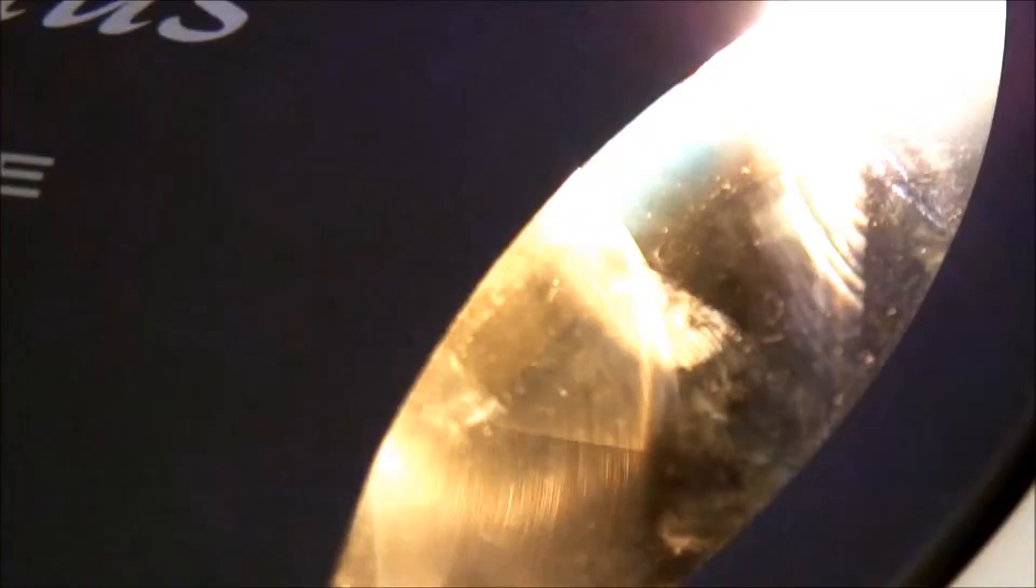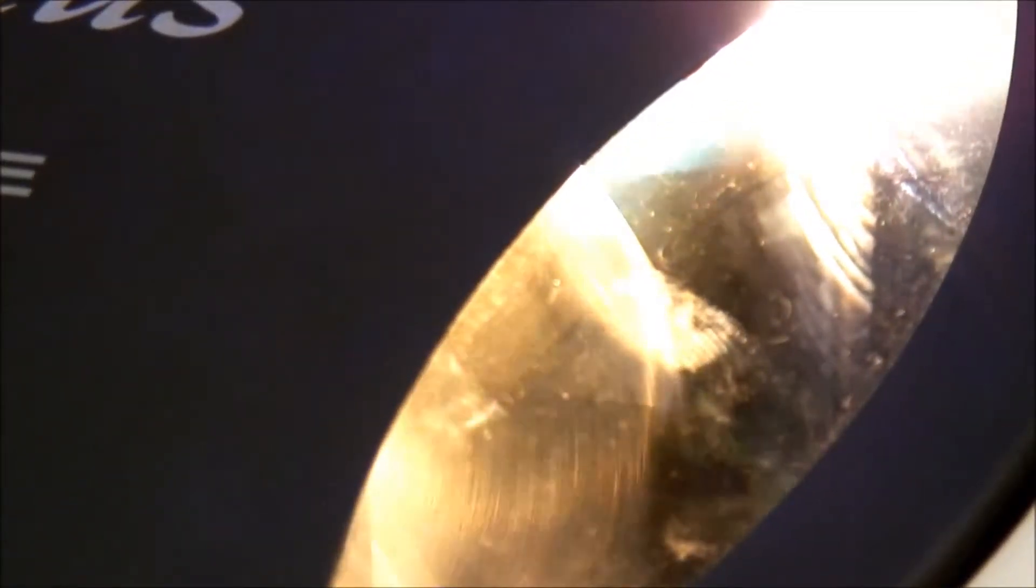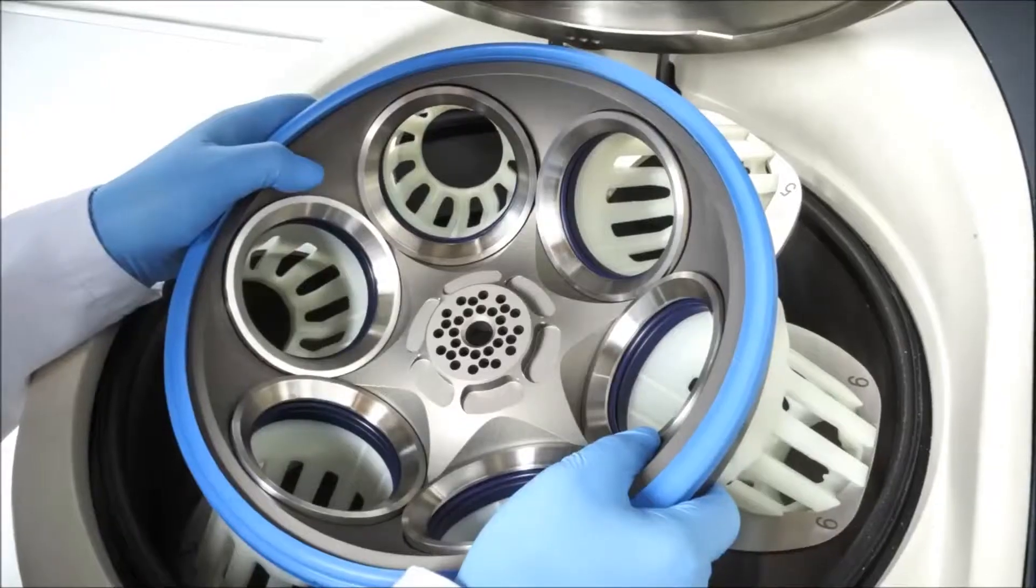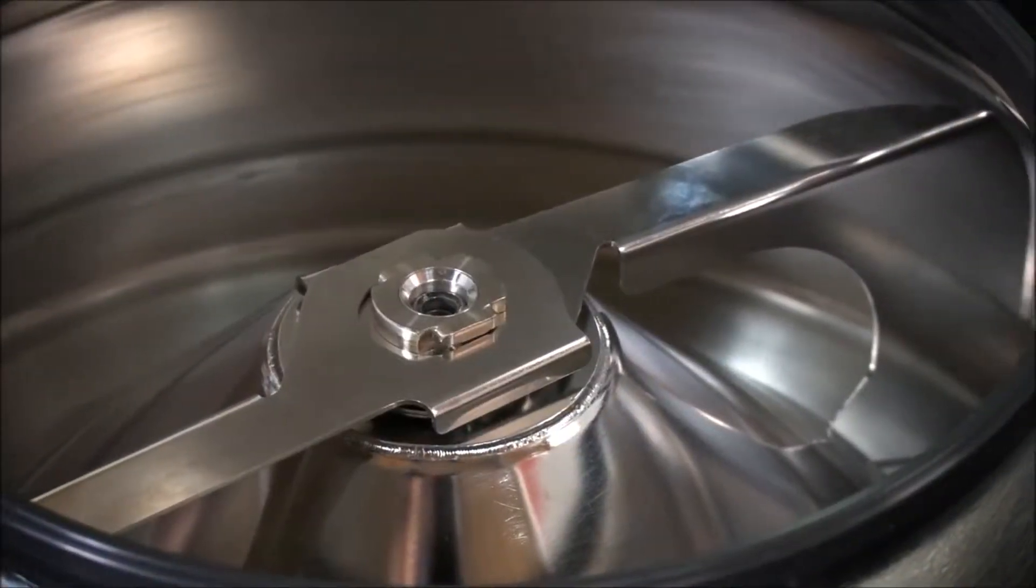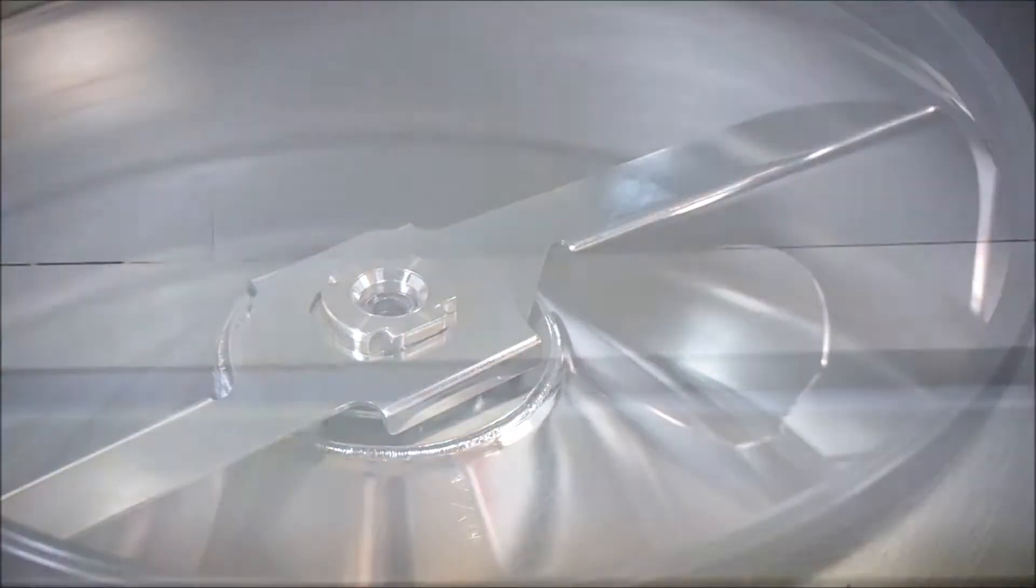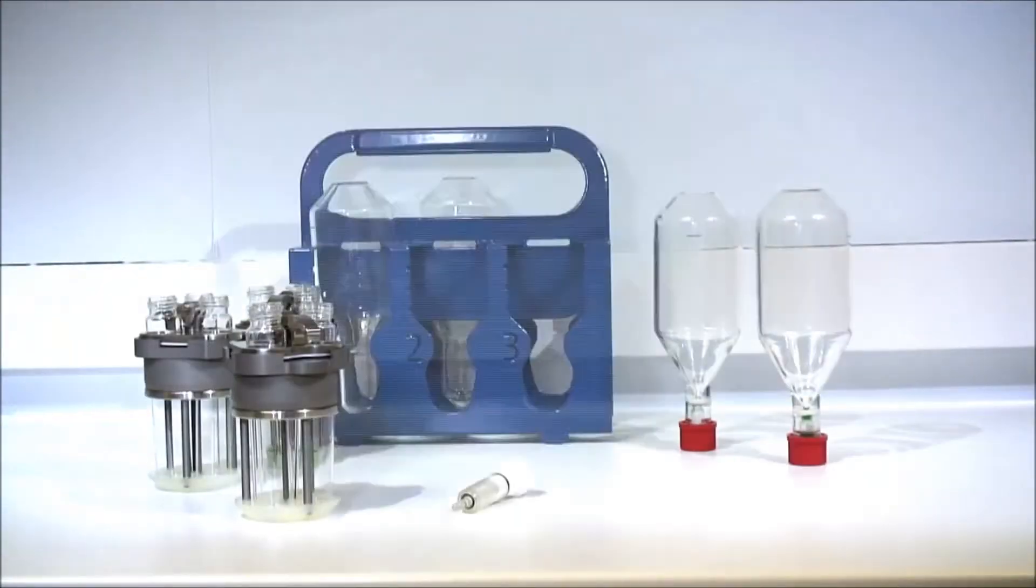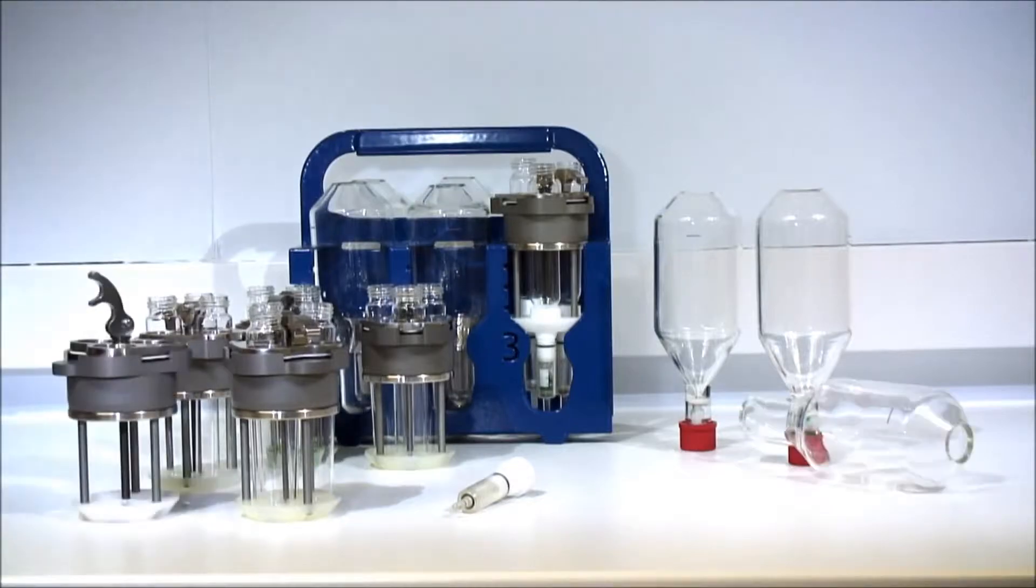This technology can be used with several systems to process different formats, either drying or concentrating the samples. The latest Synergy series offers the unique flexibility of interchangeable rotors, enabling the processing of the widest range of sample volumes in a single system.